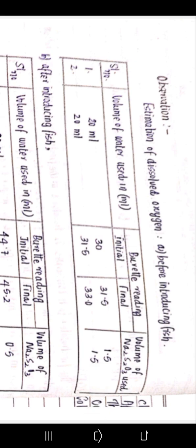Here we can see an observation: estimation of dissolved oxygen before introducing fish. Volume of water used in ml, 20 ml. Burette reading initial 30, final 31.5, so we could see the volume of Na2S2O3 used is 1.5. After introducing fish: volume of water used, burette reading, volume of Na2S2O3 used.